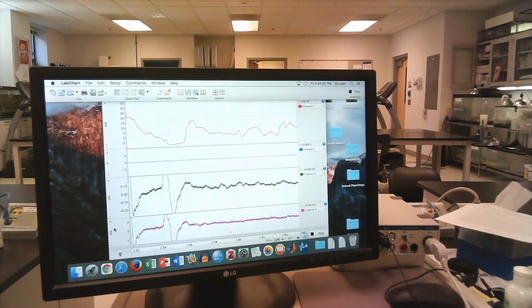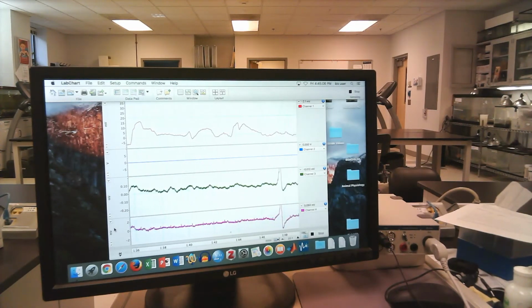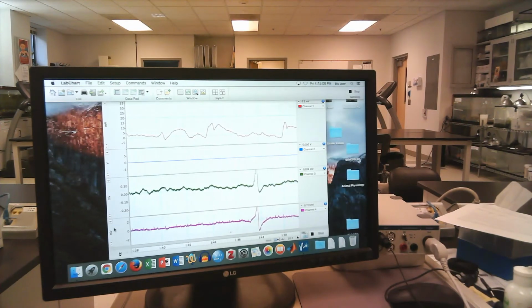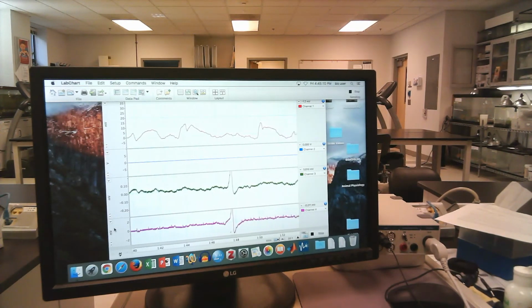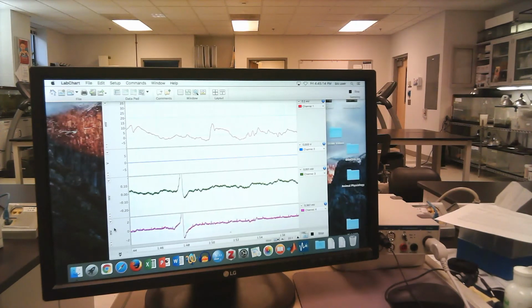So now what I'm going to do is I'm just going to take a minute at rest. I'm going to breathe, and I'm going to try to get a clear recording of my breathing rate, my breathing volume, and my heart rate together.